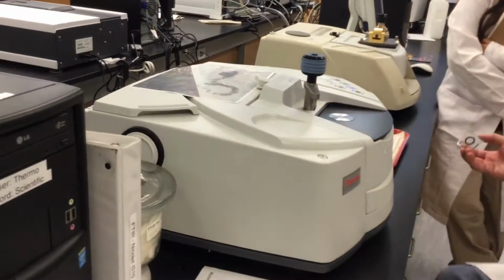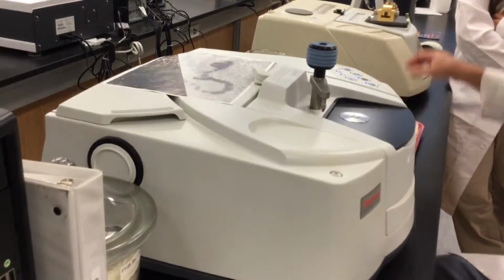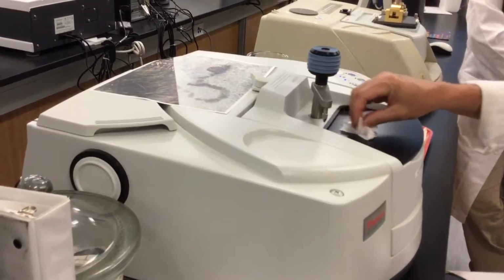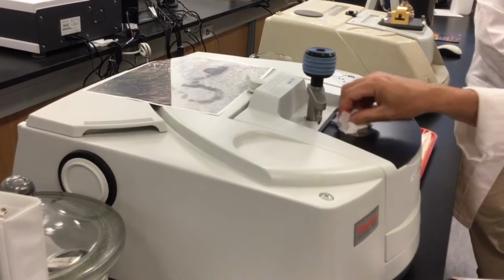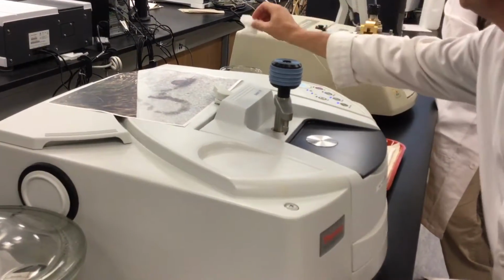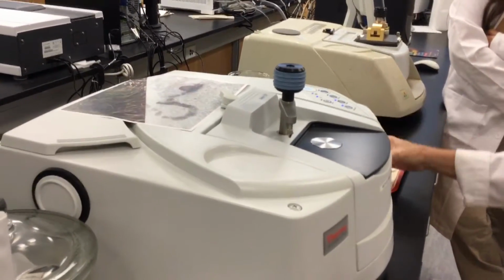Now you don't want to leave your sample sitting on the diamond for a really long time. Some of your samples are corrosive and nasty. They could break down the epoxy holding the diamond in place. So you'll wipe it up. And this paper towel for your unknown is probably going to be all stinky and weird. And so you pitch it there. And then you got to wash it a little more.